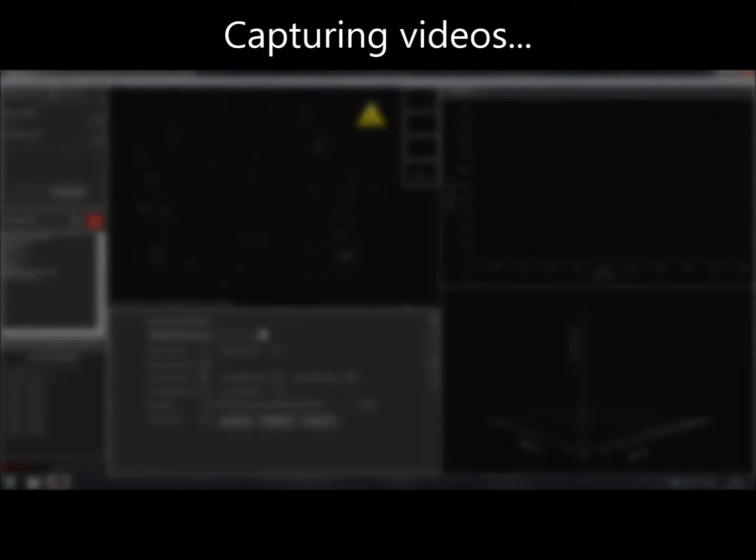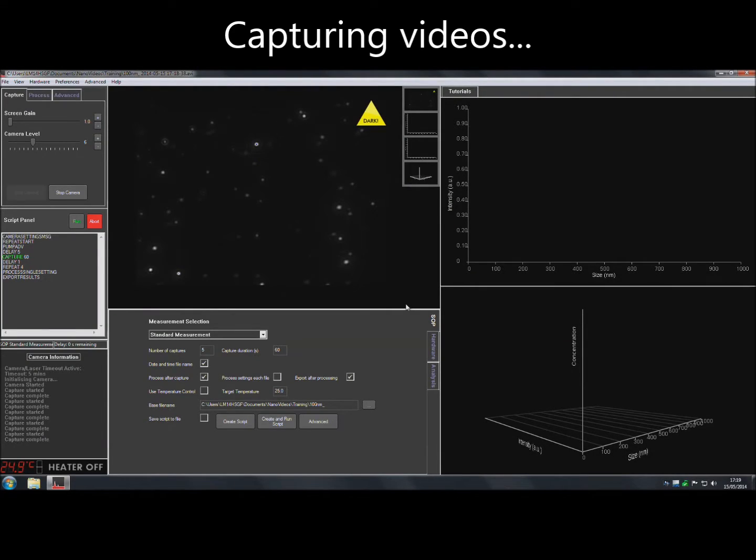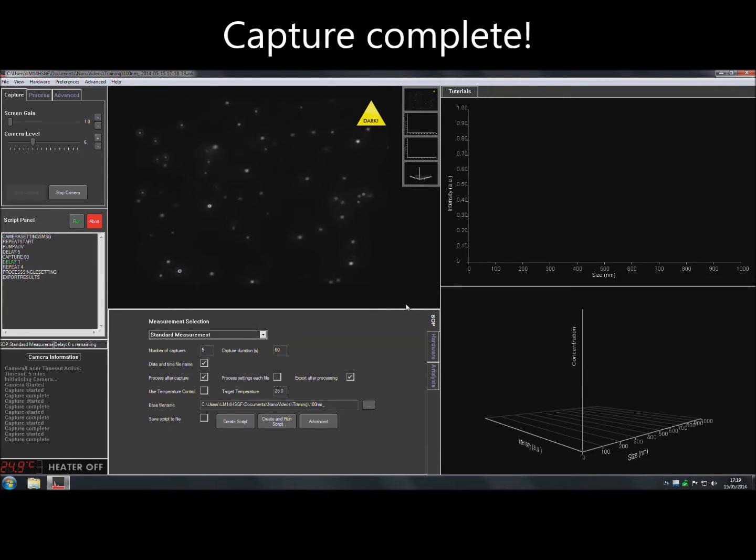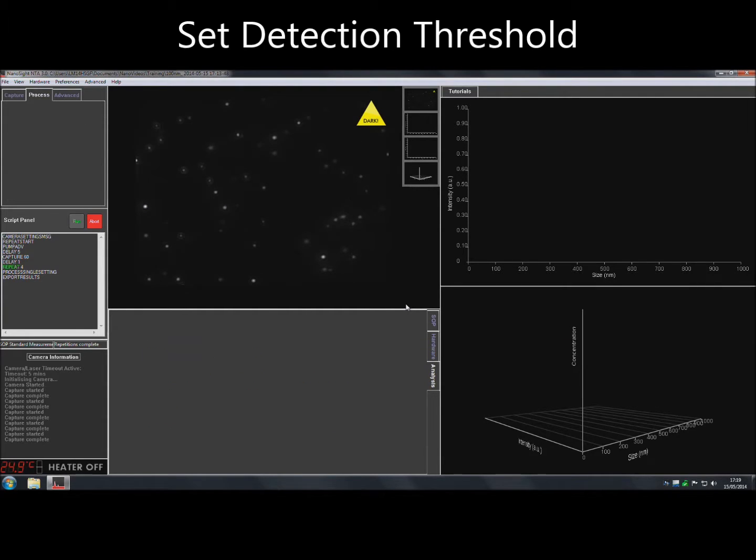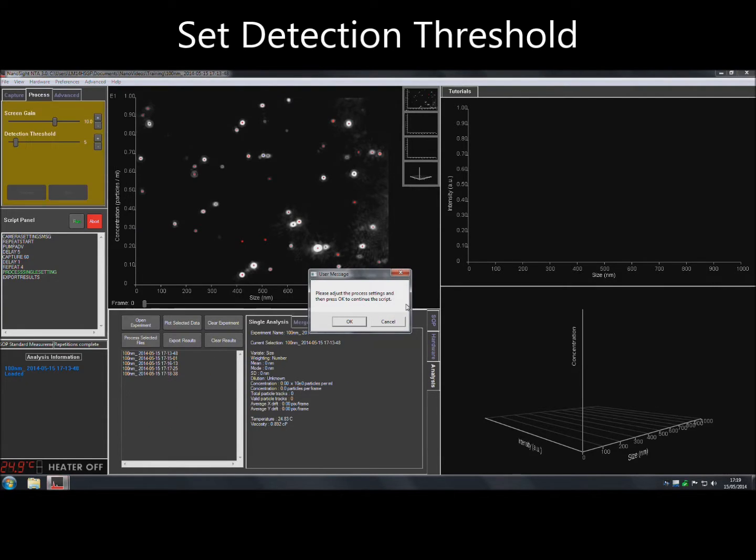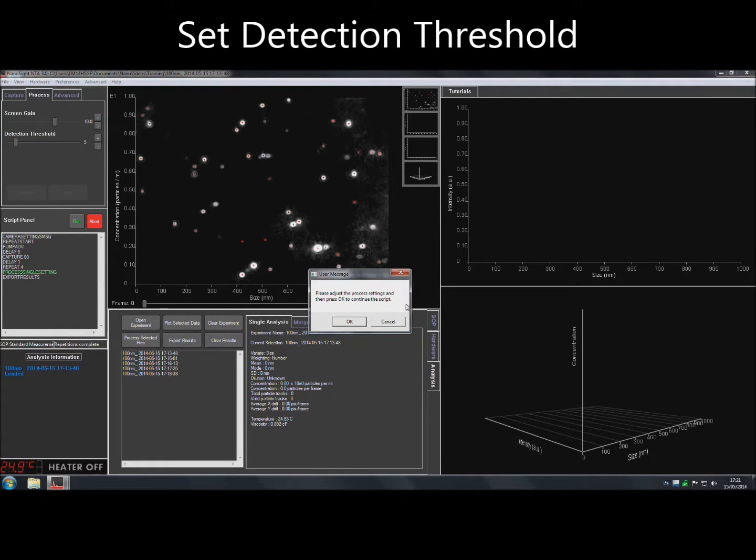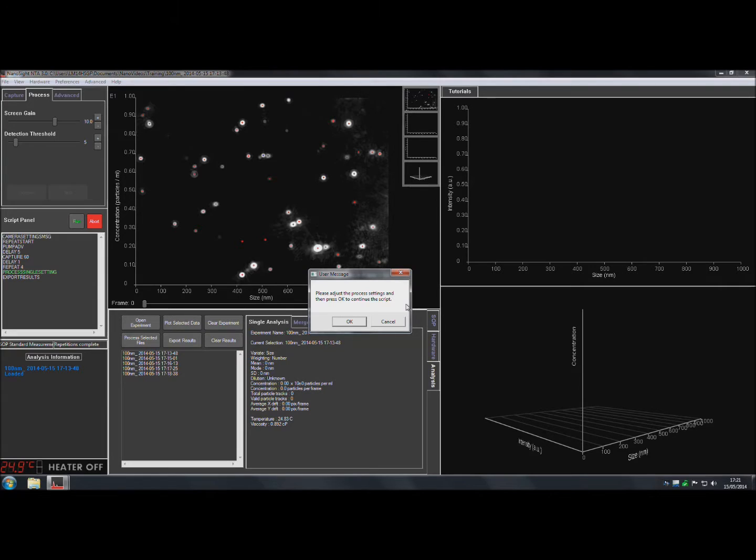Once capture is complete, the software will prompt for process settings. The detection threshold determines the minimum brightness of pixels to be considered for tracking. The lower the setting, the more particle centers will be found. But if this setting is too low, noise could be tracked. If the setting is too high, particles will be excluded from tracking.